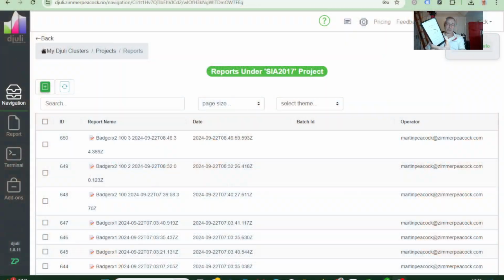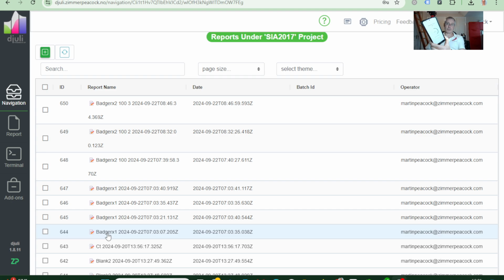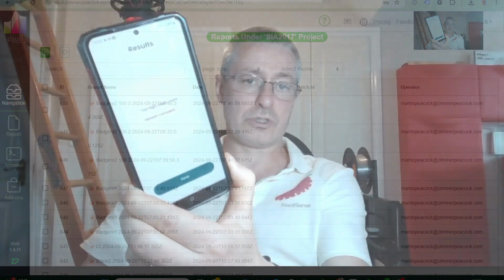In the meantime, I'm going to go to this screen, where I have a few examples. Like I said, I'm not so much interested today in the result, I'm interested in comparing results over time. Somebody asked us in a recent training session whether we could compare results over time, and when this result has completed and gone to the cloud, I will show you. It's going to upload in a minute, it'll update in a second, and when it does, I will show you that the result has gone to the cloud.